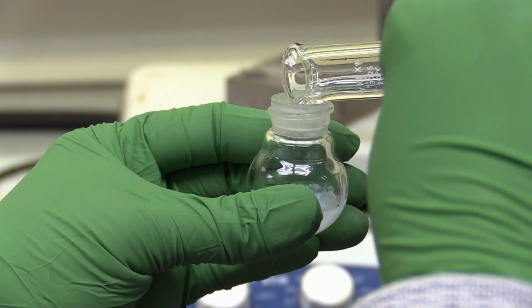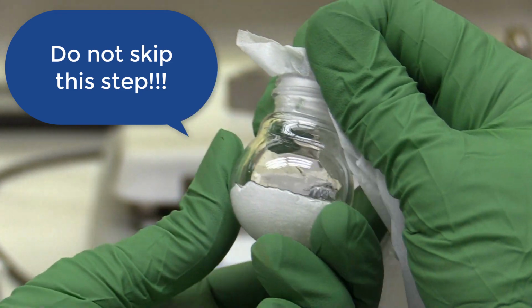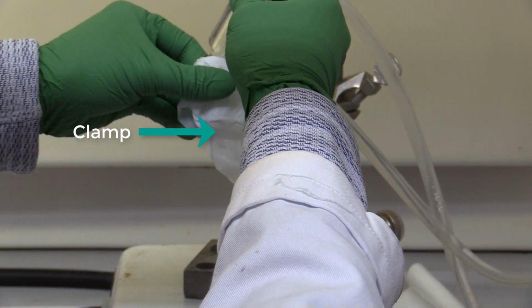Add sodium hydroxide to the flask and wipe out the inside of the flask neck with a Kim wipe. If you skip this step, the joints may get stuck together and we will not be able to take it apart. Clamp the neck of the flask and wipe out the outside joint of the condenser.